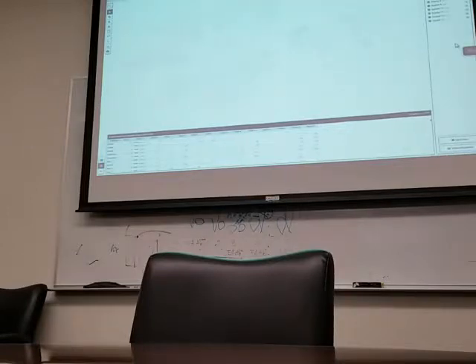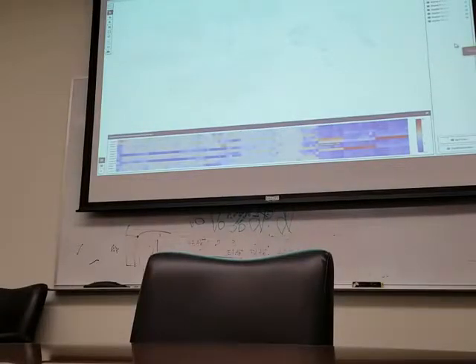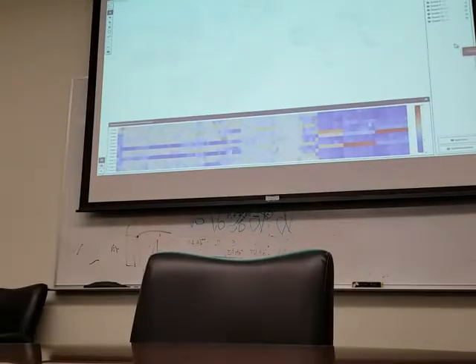Yeah, because you look at that heat map and say, oh, that's quite interesting. Here's this one, here's this one. Are they the same or not? Especially the heat maps of the norm. You only got 2, but 3, yeah, there you go. Oh, that's even better. How'd you do that? Make it at least a bigger square. You can adjust it. Where is that adjustment? It's just a drag bar.